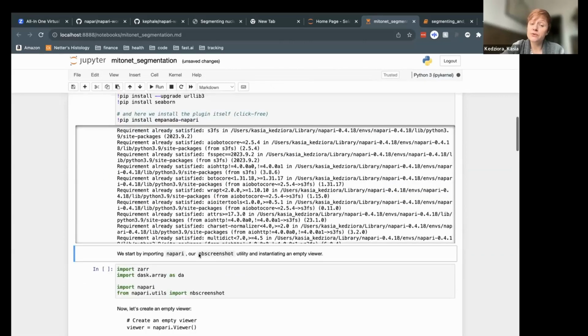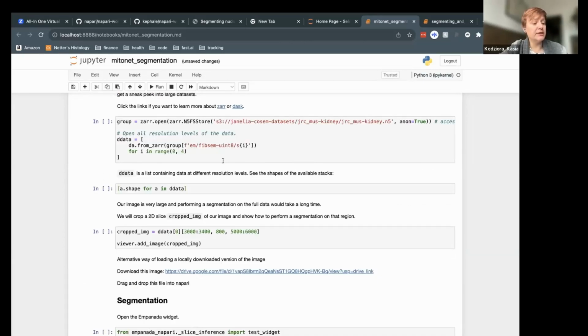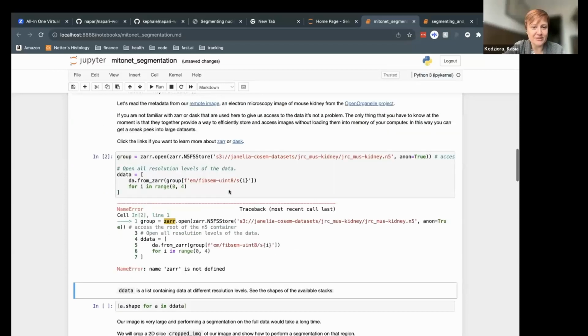And this is another, in the previous notebook, we just got a NumPy array, which was available under the URL. Here we will get access to the Janelia electron microscopy data. So it was actually, for the sake of this notebook, an absolute exaggeration. It's a gigantic data set of the morphology, with amazing resolution, of the morphology of cells. We will use it to only get a tiny piece for an example of segmentation. But I decided to put it out there so that you know how to access this data and play with them. And hopefully it will be useful for you.